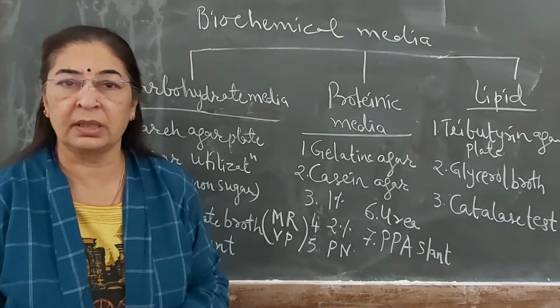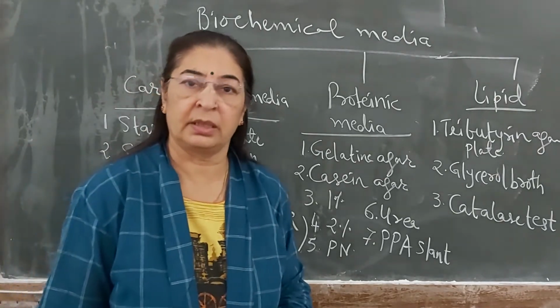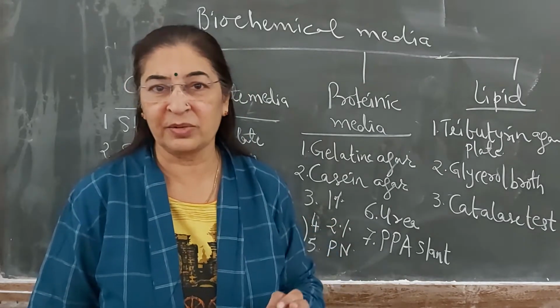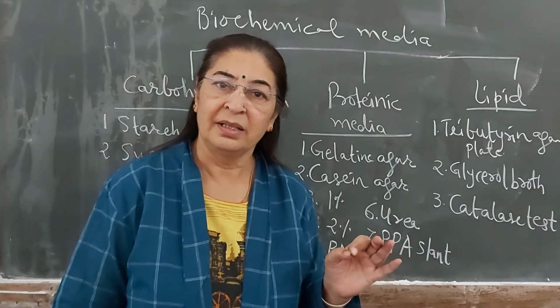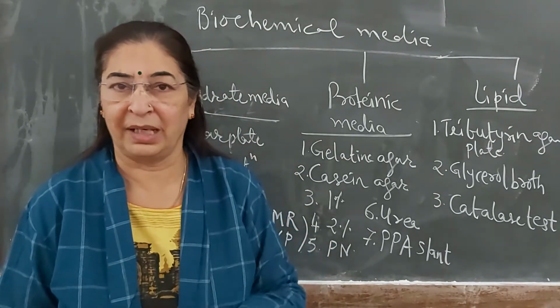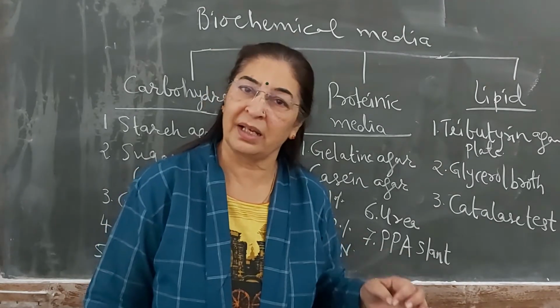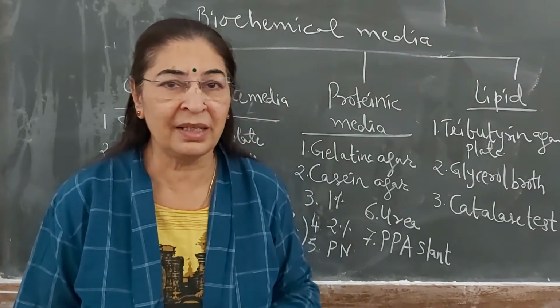We are going to study the identification of gram-negative bacteria on the basis of biochemical characterization. As we have understood earlier, the reactions which occur in a chemical manner in the biological system are known as biochemical reactions, and these reactions are carried out by particular enzymes.